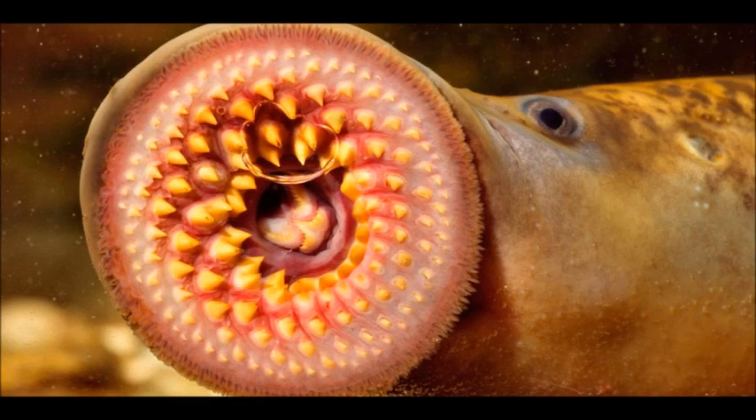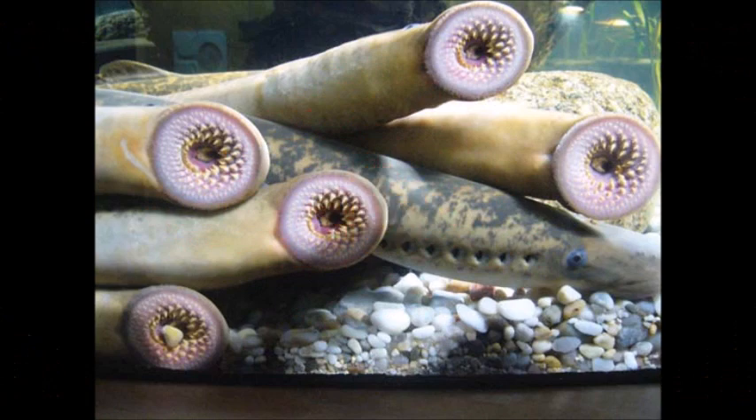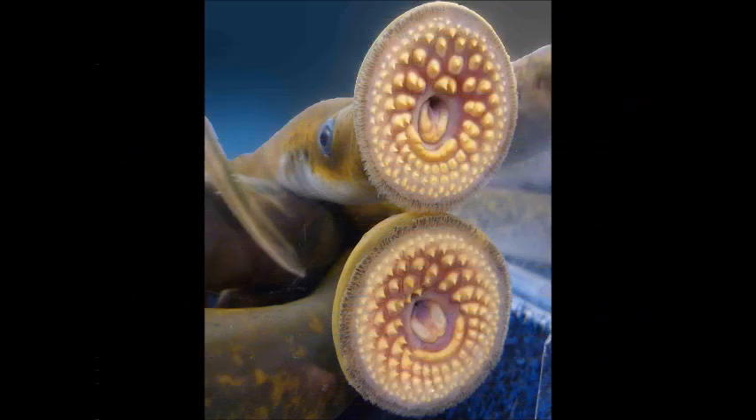The skeleton of a lamprey consists of cartilage. The mouth is a round sucking aperture provided with horny teeth. Lampreys begin life as burrowing freshwater larvae. At this stage, they are toothless, have rudimentary eyes, and feed on microorganisms. After several years, they transform into adults.